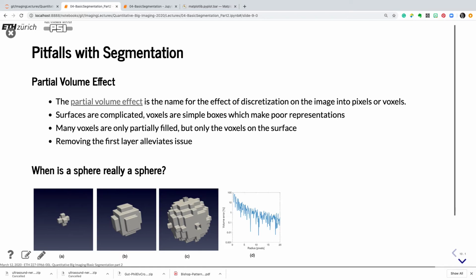And that is the problem when you come into the partial volume. And also around the edges, there are edge positions that are not really filling out the whole pixel, and they appear as less intense in the data, and they will also be misclassified.